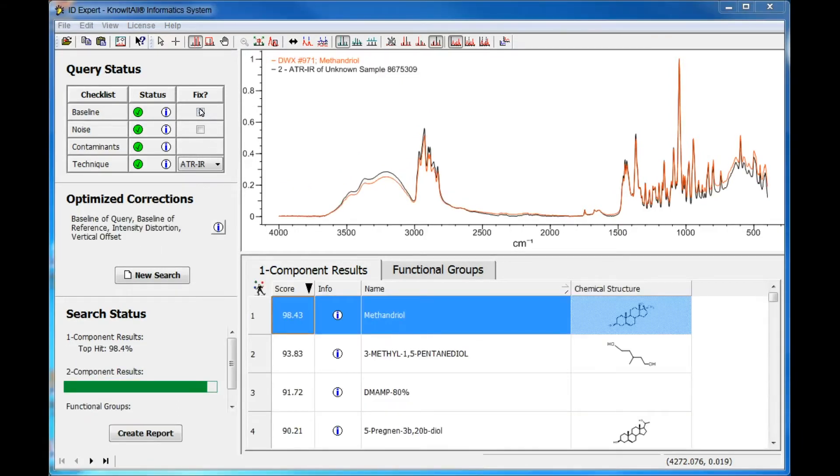The software then automatically applies a series of optimized corrections to both query and reference spectra to identify the best matches in the database. Any optimized corrections made are listed. In this case, the bad baseline was corrected in both the query and reference spectra, and several other corrections were also applied. Click the Information icon to get more specific information on each correction performed.